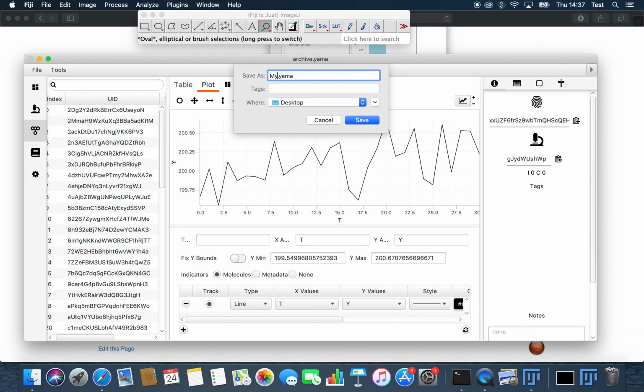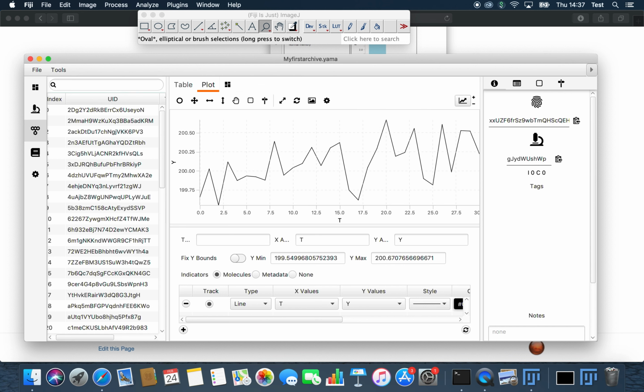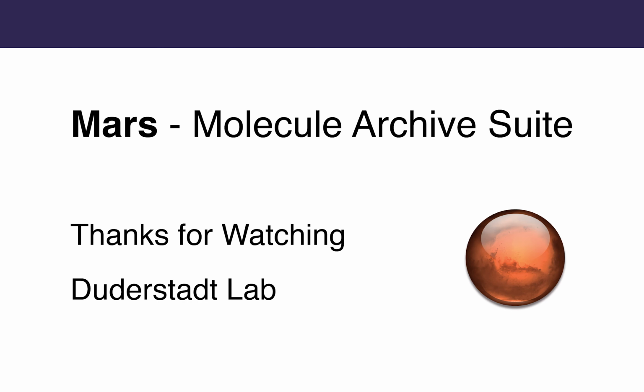In the next tutorial we will calculate the variance. Check out our website for more in-depth information or detailed explanations.